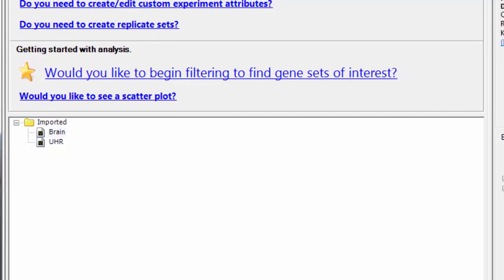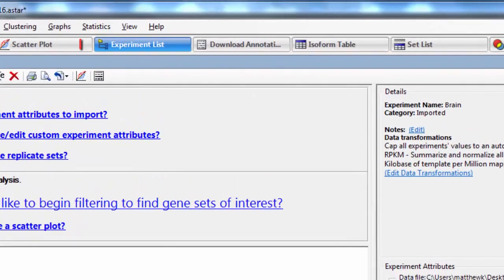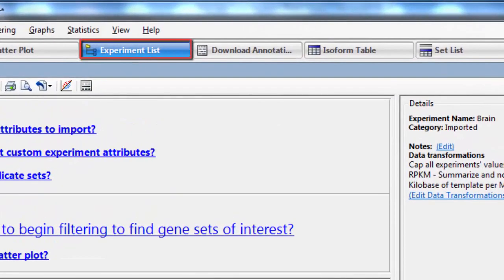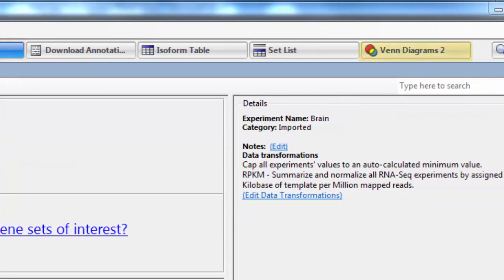There are several different ways to filter your data and create these groups, which we call sets. One way is to use the quick set wizard, which you can access either from the experiment list view or from the Venn diagram view.